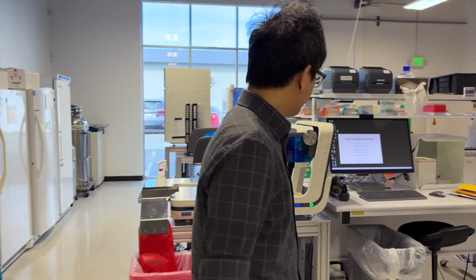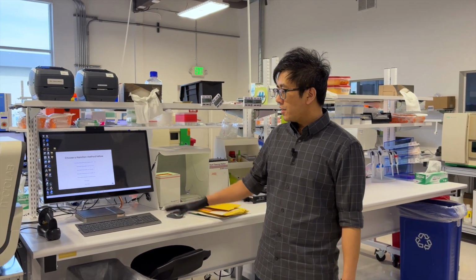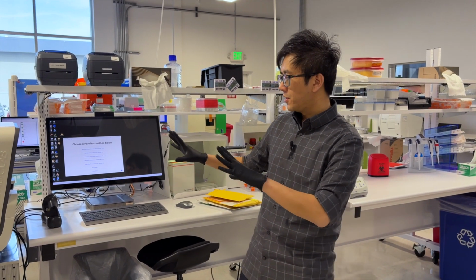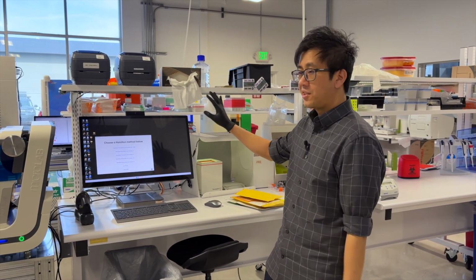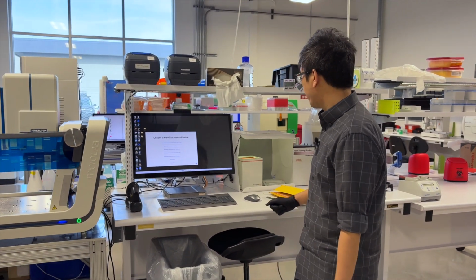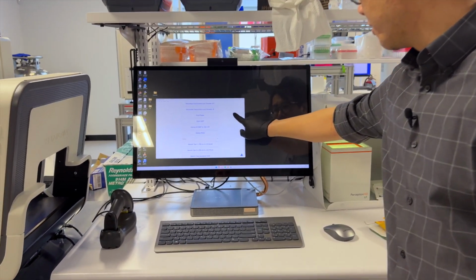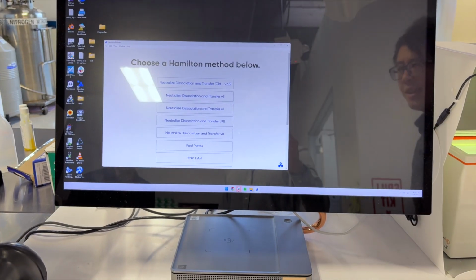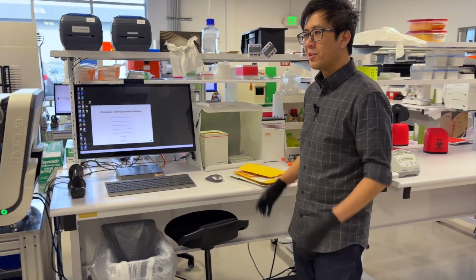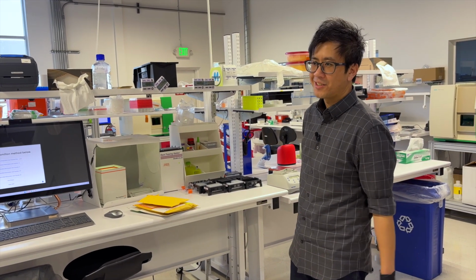Cool. So this is walk-up automation used by the scientists directly. That's correct. One theme you'll start to see here, aside from our integrated work cell over there, is this idea of separated areas of automation, but still with a software layer on top of it to make it as easy as possible for scientists to use. So for example, with this machine, this is a little homemade app that we wrote ourselves with the little Eigen logo to just choose a method that we've created. You tap one of these things and it'll just kick that off and start your method. And so I think there's a lot of promise here in building software on top of your automation to make it easier to use. And you don't really need a fancy robot arm or an integrated system to do that.